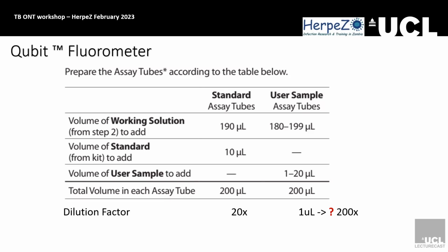If you want to do more, that's fine. But obviously, 10 microliters is an awful lot, especially if you're eluting into 20. So 1 to 2, 1 to 3 is probably fine. We were using 3 microliters before, because at 1, if you measure the same sample twice, sometimes you get a bit of variance.